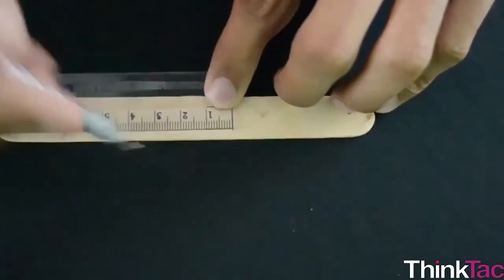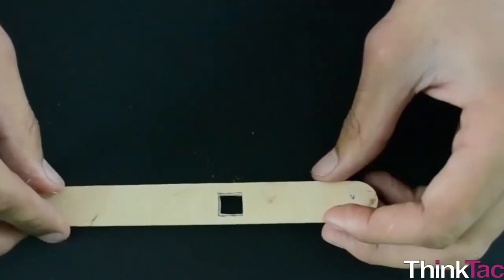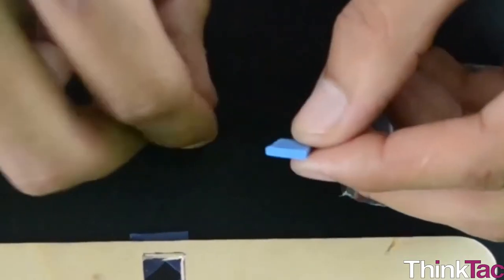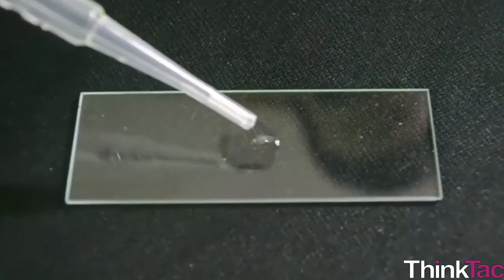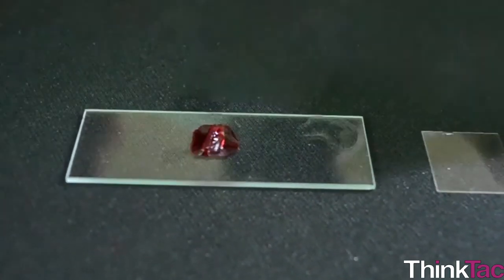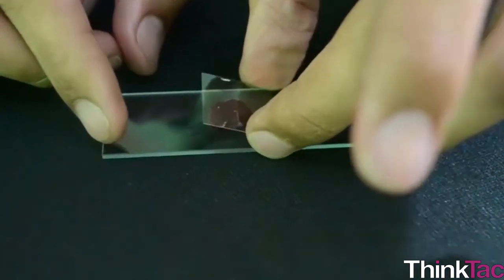We hope that you have had fun while assembling and using your very own simple microscope. Now that you know the principle behind how a simple microscope works and how useful it is, we encourage you to use it for more objects around you. Just like you learned how to look for onion cells and even the organelles within, you can continue your explorative journey to look at things in even finer detail. Have fun. Goodbye.